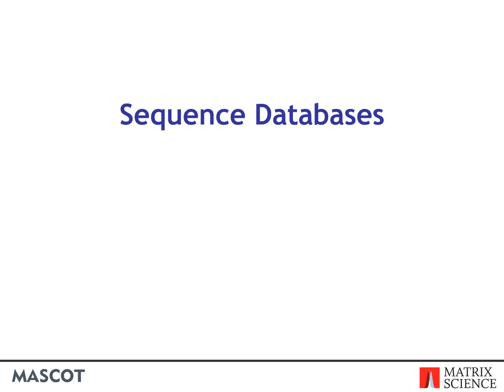In this presentation, I'll be describing the characteristics of the different sequence databases you can search with Mascot. With this information, you should be able to choose the most suitable database for your searches.